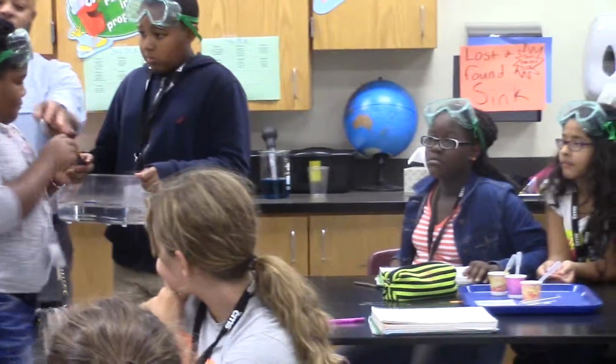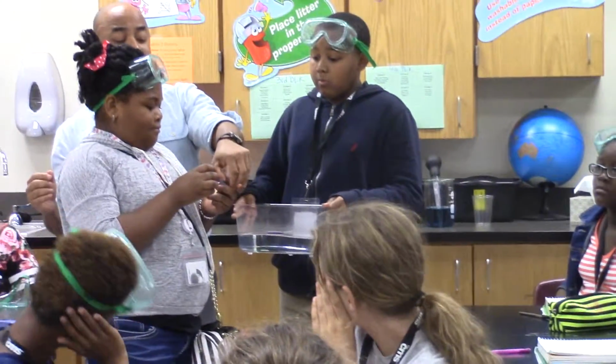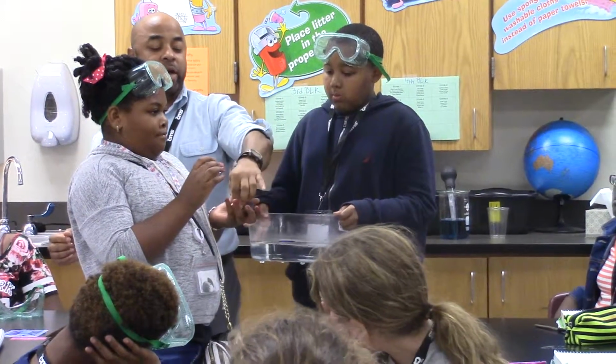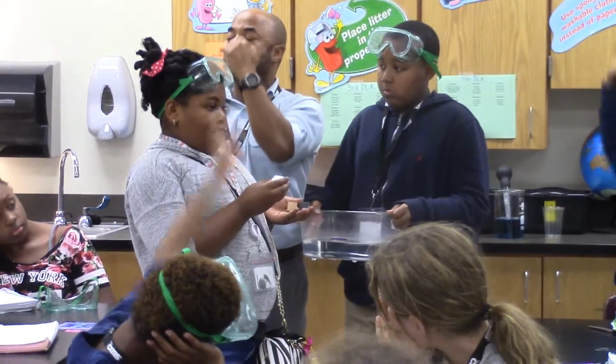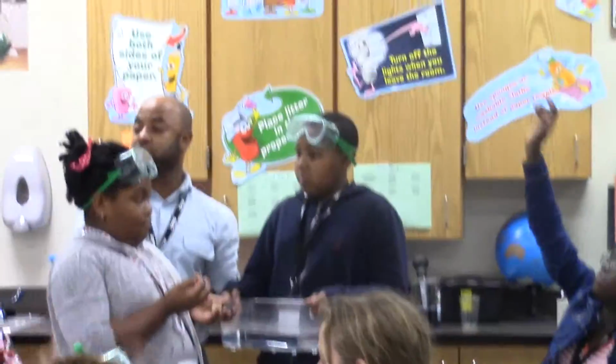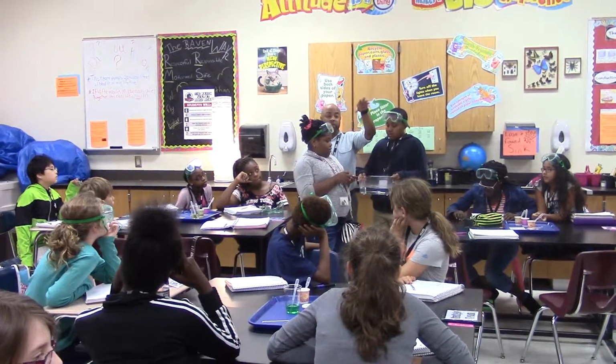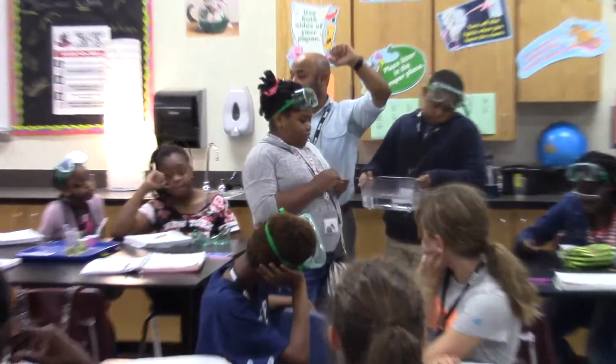So, all right. We had 3 things that we used in the last lab. We had aluminum, we had a plastic, and then we had this wooden piece right here, all right? Which do we remember which one was the most dense? Tiara? The metal, this aluminum. So when we placed the aluminum in, we saw that it was denser than water. And how do we know that?